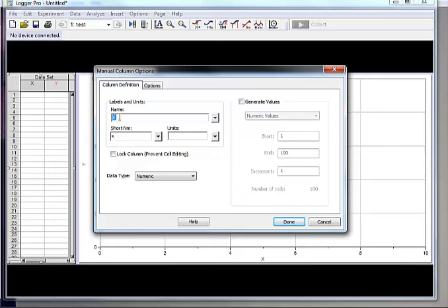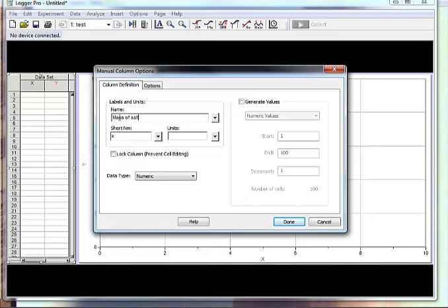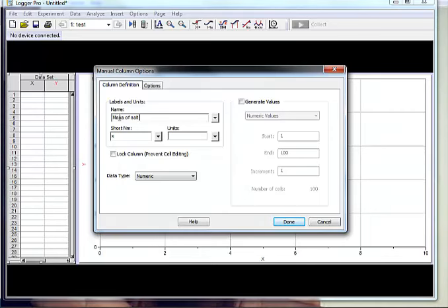Mass. So for X, we want to call this the mass of salt. The question is, how much water did you put it in? In your procedures for your lab group, you must say mass of salt in and tell me how much water you're using. That make sense?